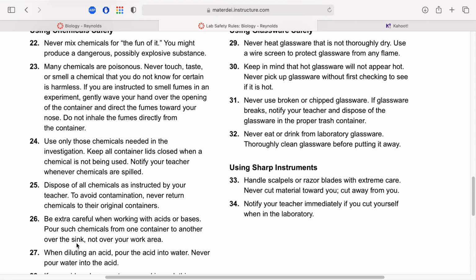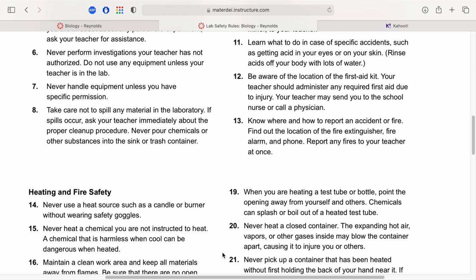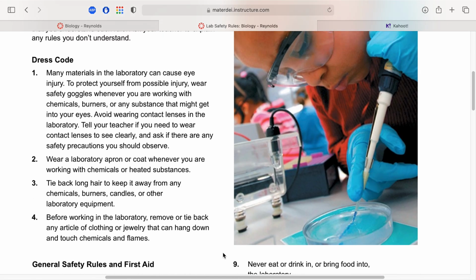We do a little bit of work with some dilute acids and stains, so you might be wearing gloves, safety goggles, maybe even an apron to keep your clothes from getting stained. Up in the top drawer, right there in the cabinet, you'll find that personal protection stuff.